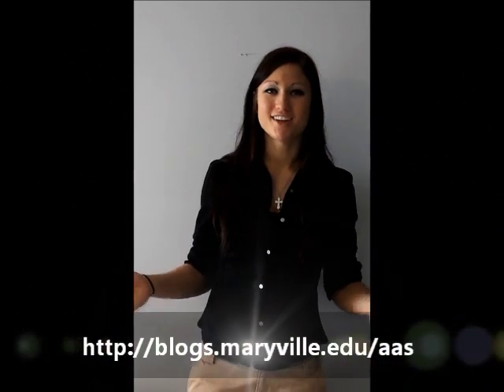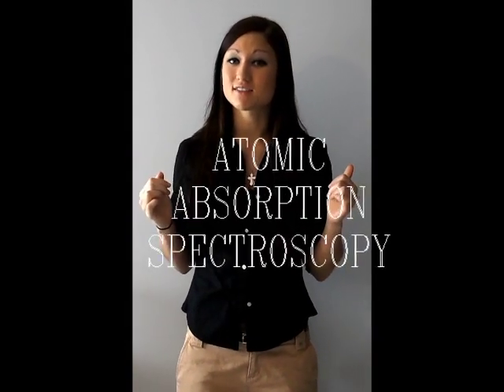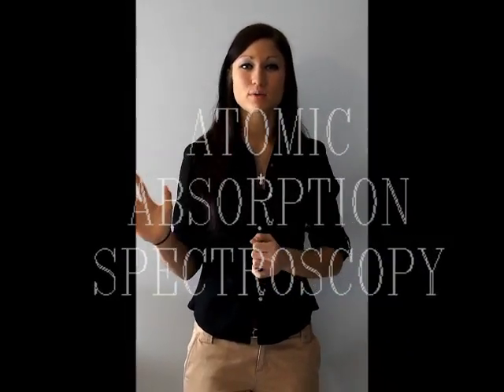Welcome to our webpage. This video is going to further explain atomic absorption spectroscopy. We're actually going to take the lid off an AAS, explain the 5 main components that make up the instrument, and show the path that the radiation travels.